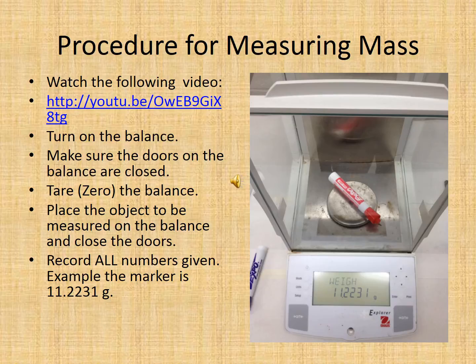Also, when you get through watching the video, some of the things that you should remember from that video are to always make sure you turn off the balance when you're done with it. Make sure the doors on the balance are closed. Always remember to tare or zero the balance before you use it. Always remember to close the doors before you take a measurement, and record all numbers given to you by it.